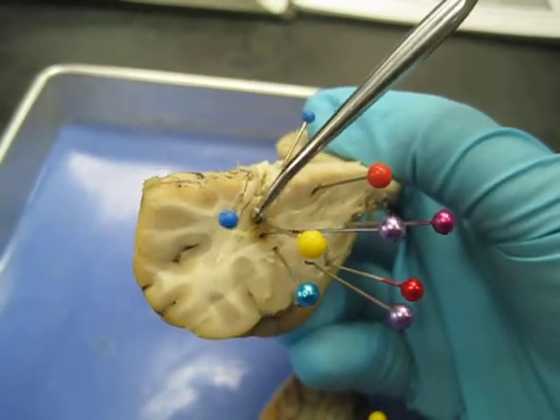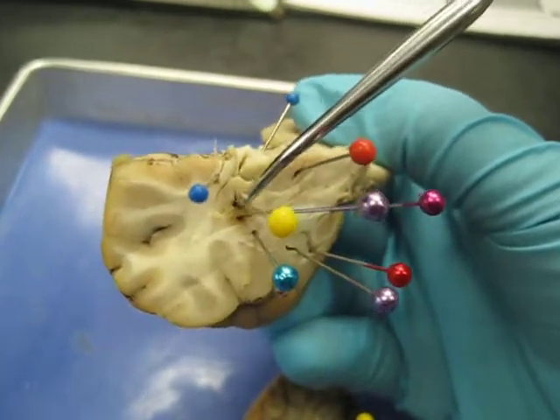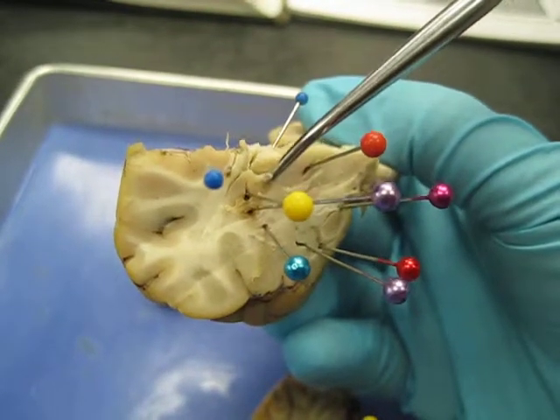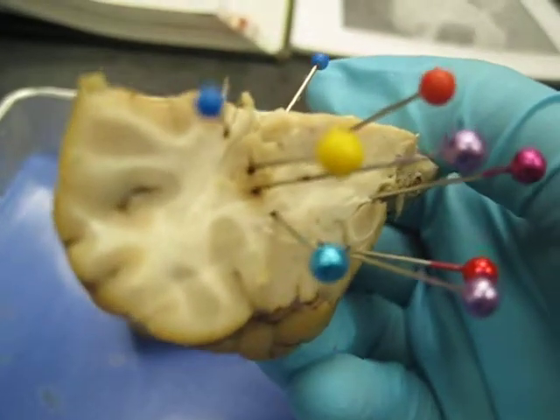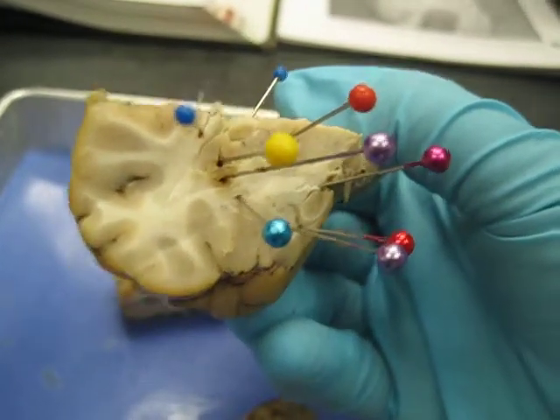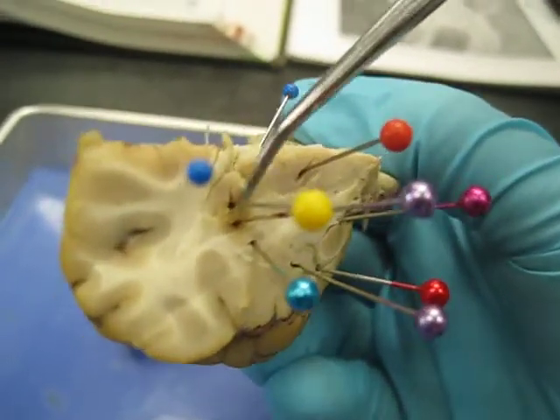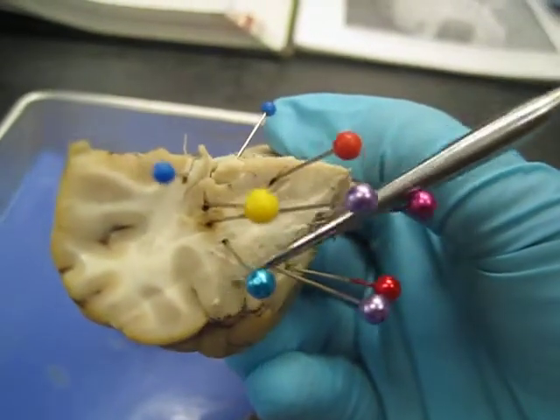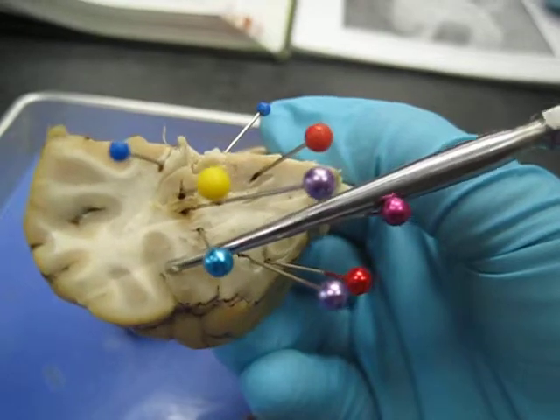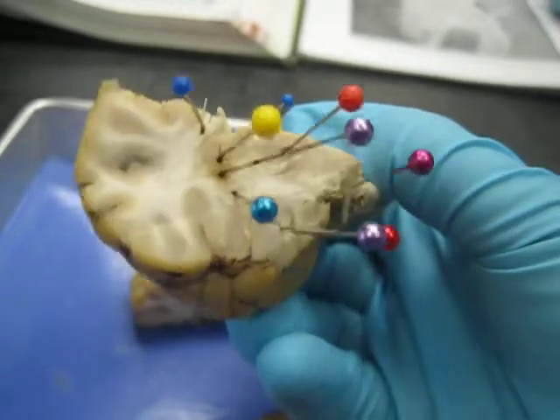You know what the dark area next to the lateral ventricle is called? Look in your lab book. It's number 3. Caudate. What is it? Caudate nucleus. Okay. And then you would have this dark area here, which is the lentiform nucleus. You have the globus pallidus.